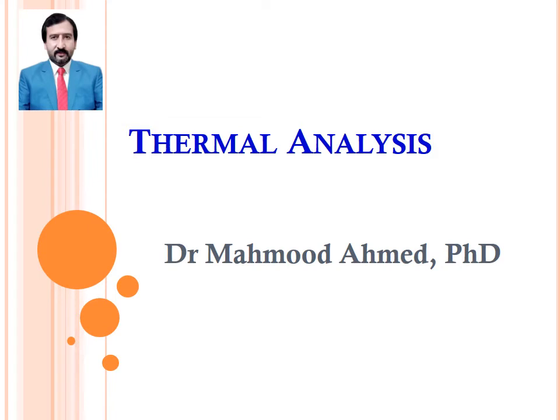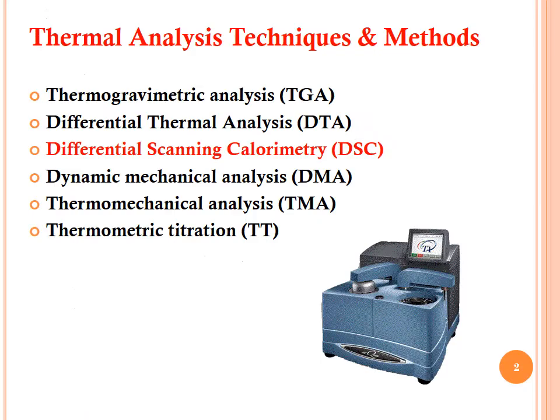Continue from thermal analysis. We have already discussed various techniques that come under the heading of thermal analysis: thermogravimetric analysis, differential thermal analysis, differential scanning calorimetry, dynamic mechanical analysis, thermomechanical analysis, and thermometric titration. Already we discussed two techniques: thermogravimetric analysis (TGA) and differential thermal analysis (DTA). Now in this lecture we will discuss differential scanning calorimetry, DSC.